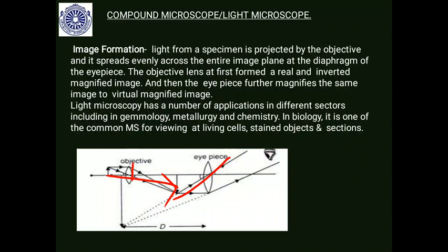You are using it for 3 years in our lab for viewing so many things like protozoa, sections of different worms, appendages of prawn, larvae of echinoderms, larvae of some other forms, the scales of fishes, sections of liver. Likewise, it's handy. Even mitosis, meiosis, chromosome study, all this you will be able to do with this microscope. You can do a lot of things. You are constantly using this. You should know how to use this.